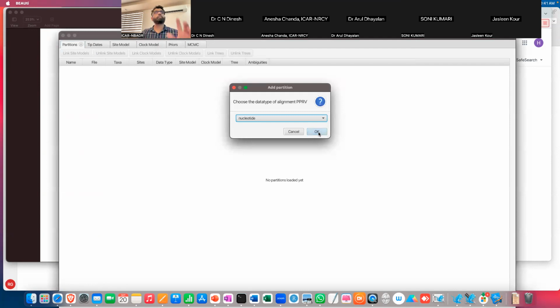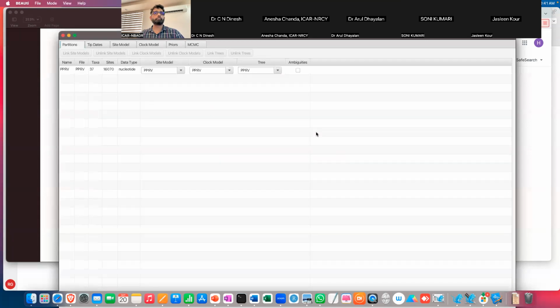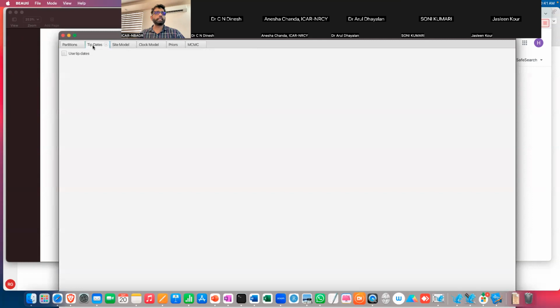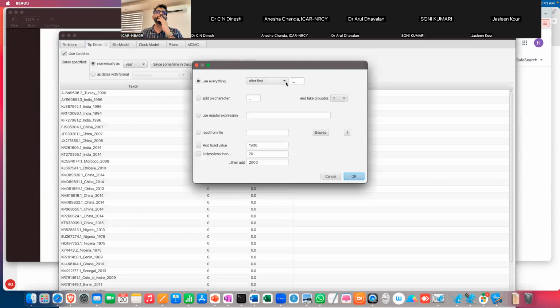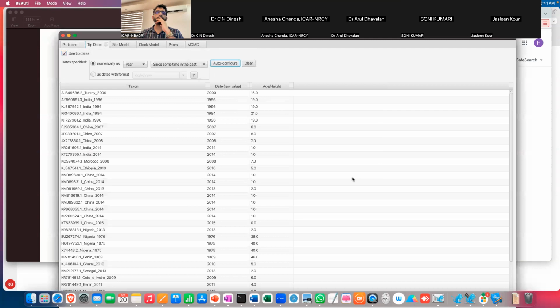Nucleotide, that's what I told you. All of you, onto this. You can do it, but please check once. Then click OK. You get this, that's what I told you. Then go into tip dates, use tip dates, you've got zeros, then auto configure, go to the last, say OK, you have got these values now.